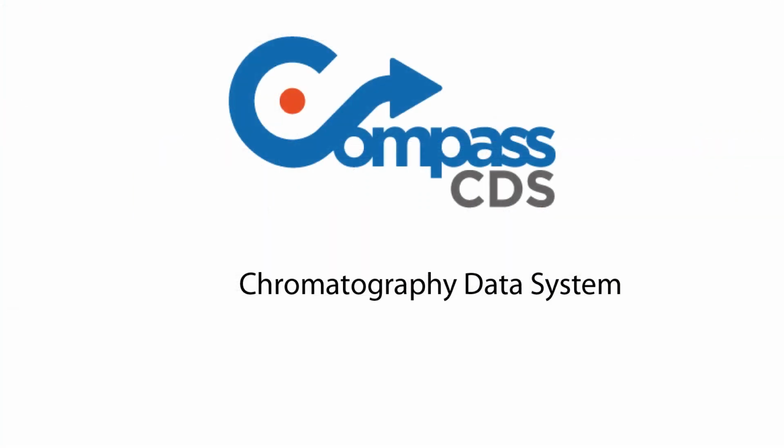CompassCDS is an operator-friendly and intuitive chromatography data software. It's been designed to improve operator experience by streamlining workflows, thereby increasing sample throughput and overall productivity. It can be installed as a standalone workstation or as a large client-server solution, which provides flexibility and safety in the case of a computer failure. Training courses are available to help maximize the benefits of the software.